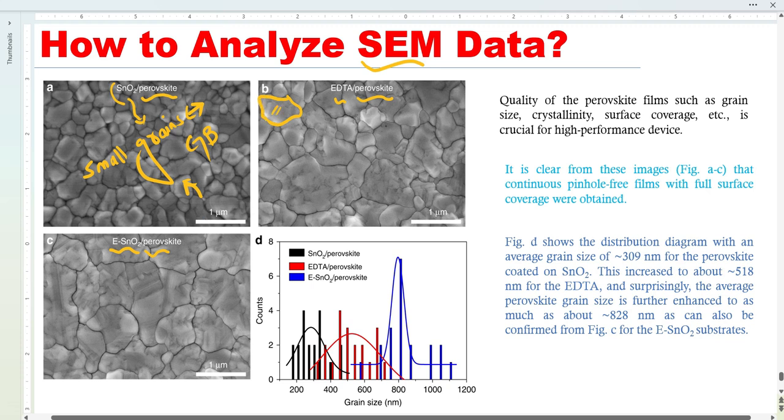We can see that the grain sizes increase. So by default, when we increase the grain sizes, the grain boundaries will start decreasing, right? Very interesting. If we do not have this SEM, how will we know that the grain size increases?